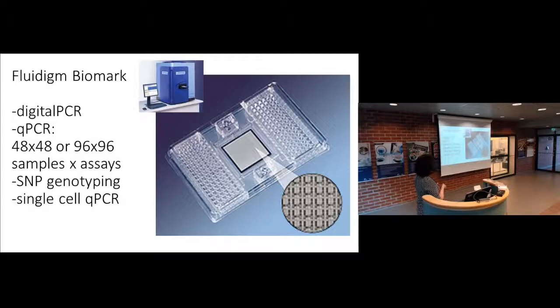So you have a cDNA library from 96 different cells, lysed and prepared one cell at a time in each of 96 wells, and you put those cDNA libraries there, and then you measure 96 genes from every cell.